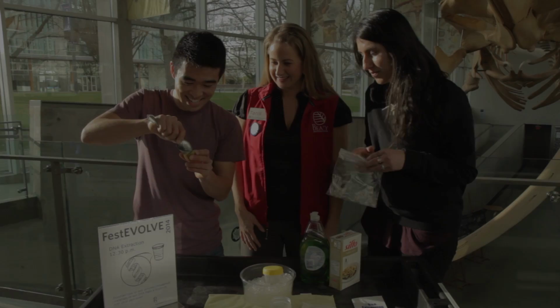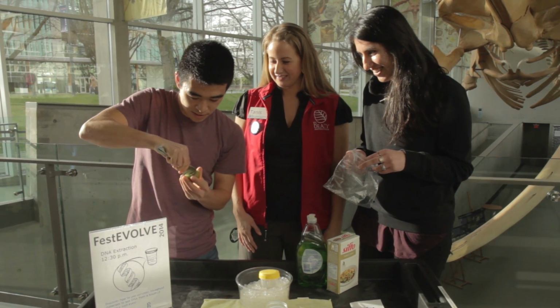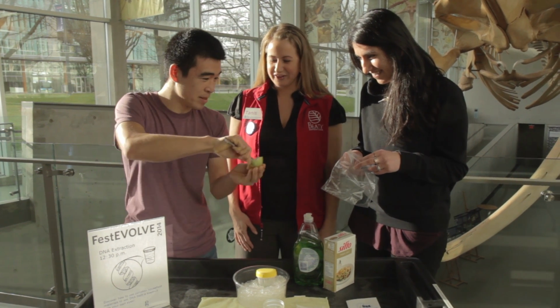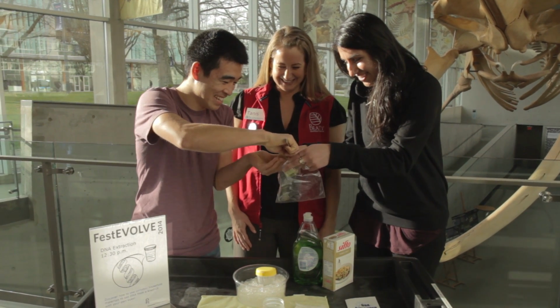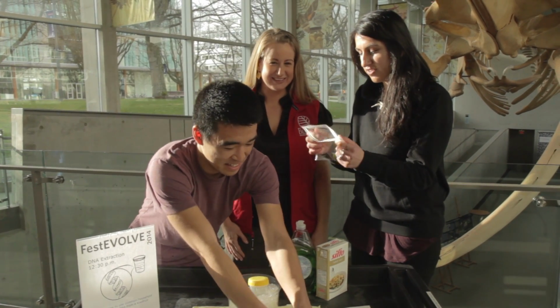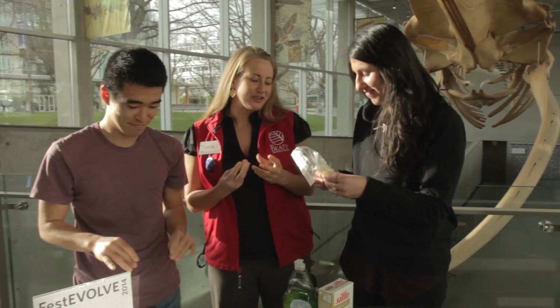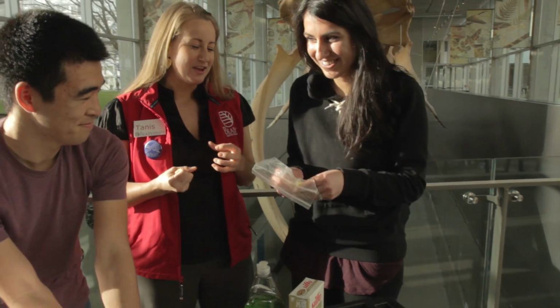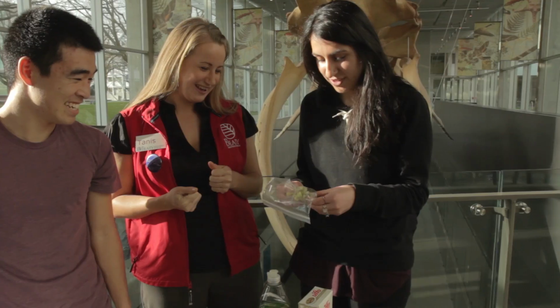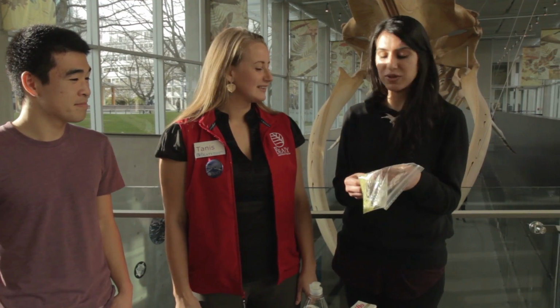I'll do it. All right. Excellent. You've done this before. Oh, definitely. Oops. There we go. Perfect. Just squish it up? Yeah. You want to massage it, so you want to do it with some force, but not too much force. Okay. How's this technique? That's perfect. Now that it's nice and squished, Tanis, what's the next step?